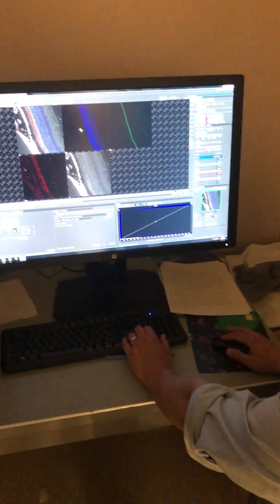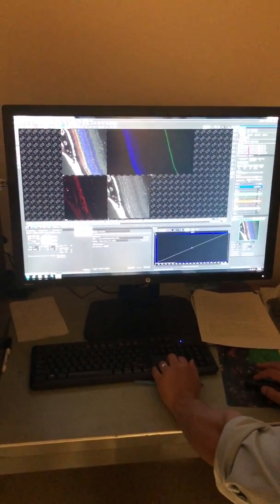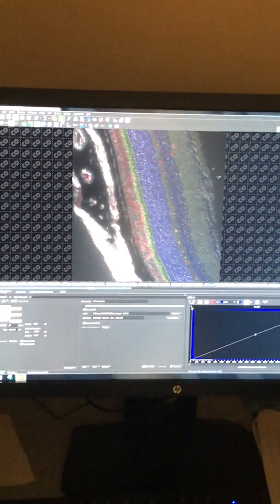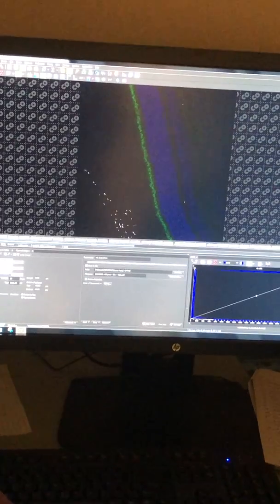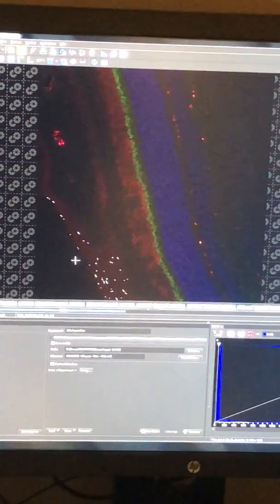Finish, you have your entire things here, and you can move. You can move in your slide here, or with this, or with the sample. Okay. And it's always worth it perhaps to have one image. If you press Control, you can take out one of the things at a time, or add at a time. If you have one of these things, the saturation port, you can deselect.